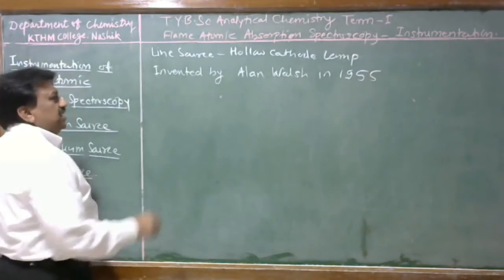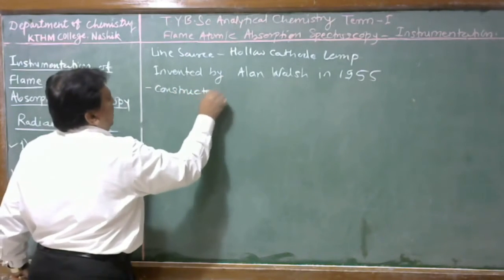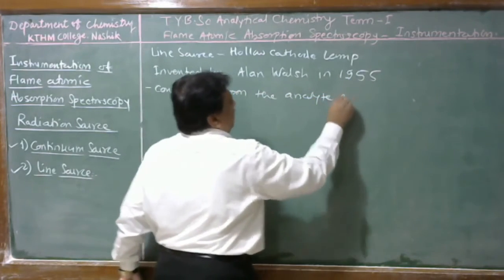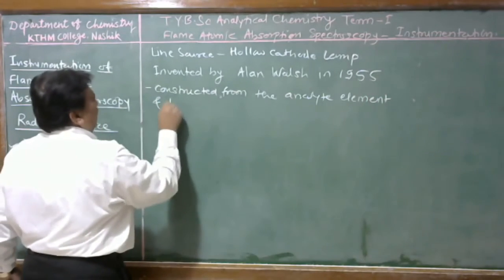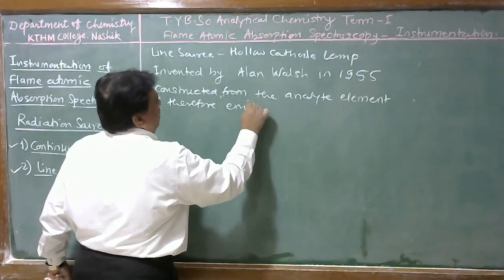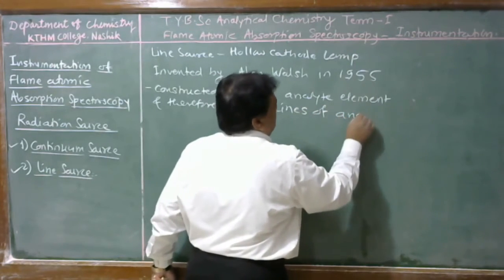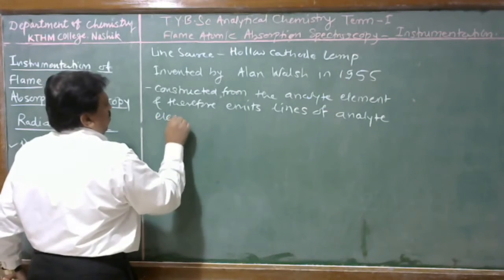This line source is constructed from the analyte element, and therefore emits lines of the analyte element only.